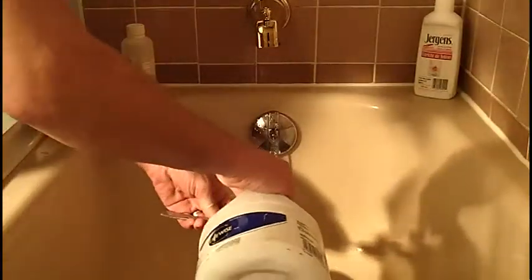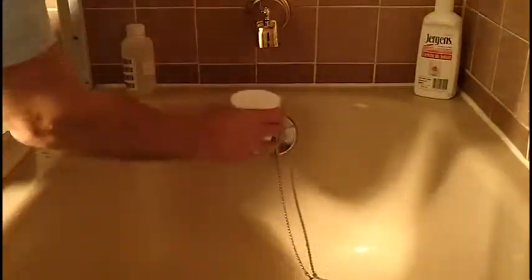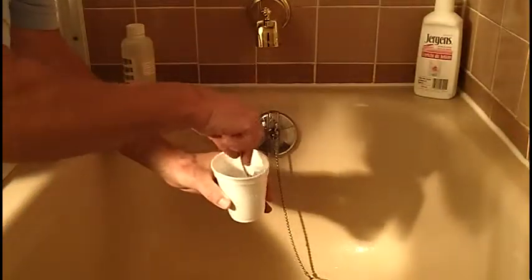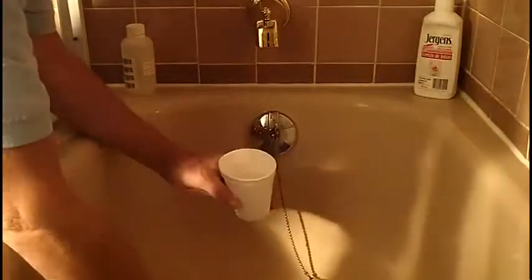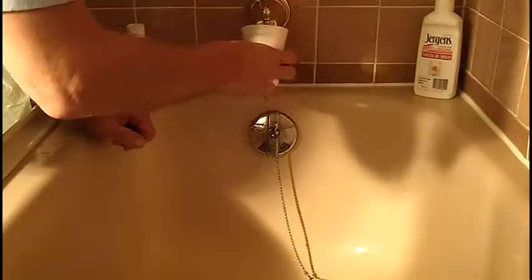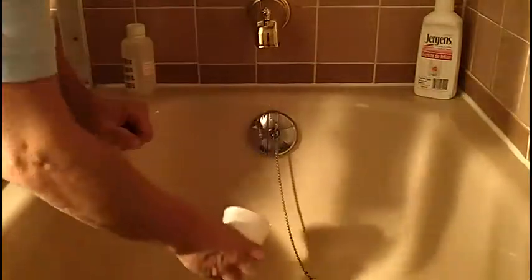To do that, we use a 1 to 10 ratio of bleach to water — one tablespoon of bleach to a half a cup of water gives us the right ratio. Give that a little stir and then submerge the faucet in this disinfecting solution, and that'll kill any bacteria that might be in the faucet.